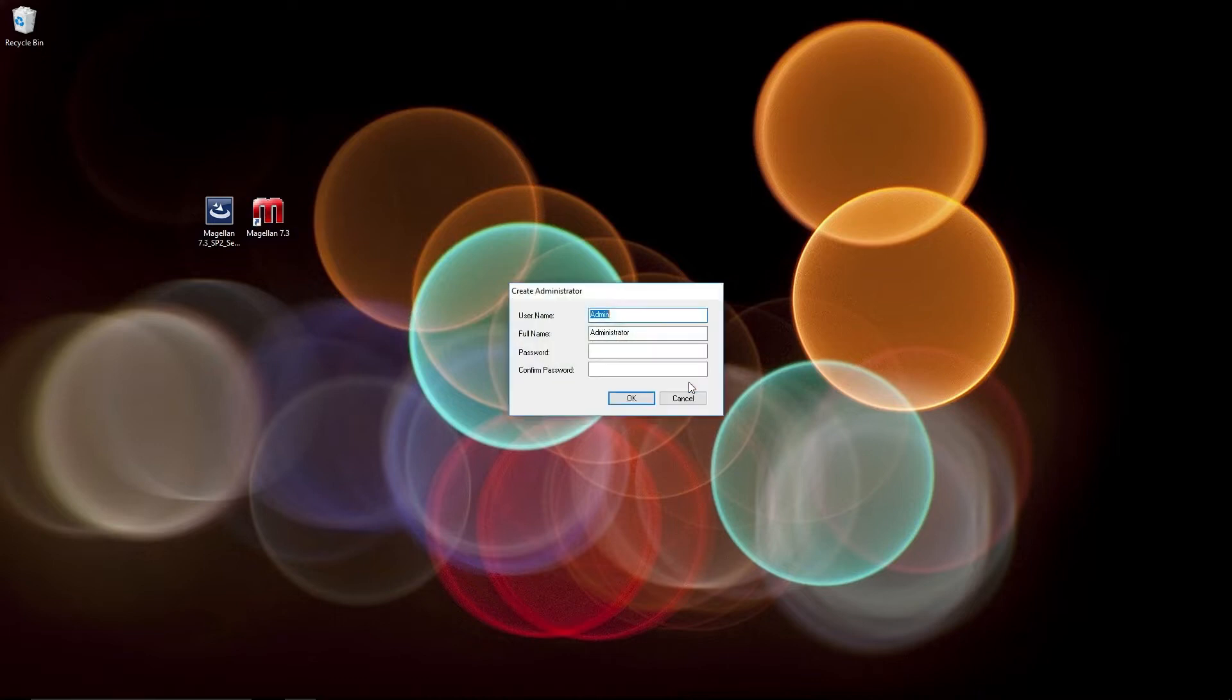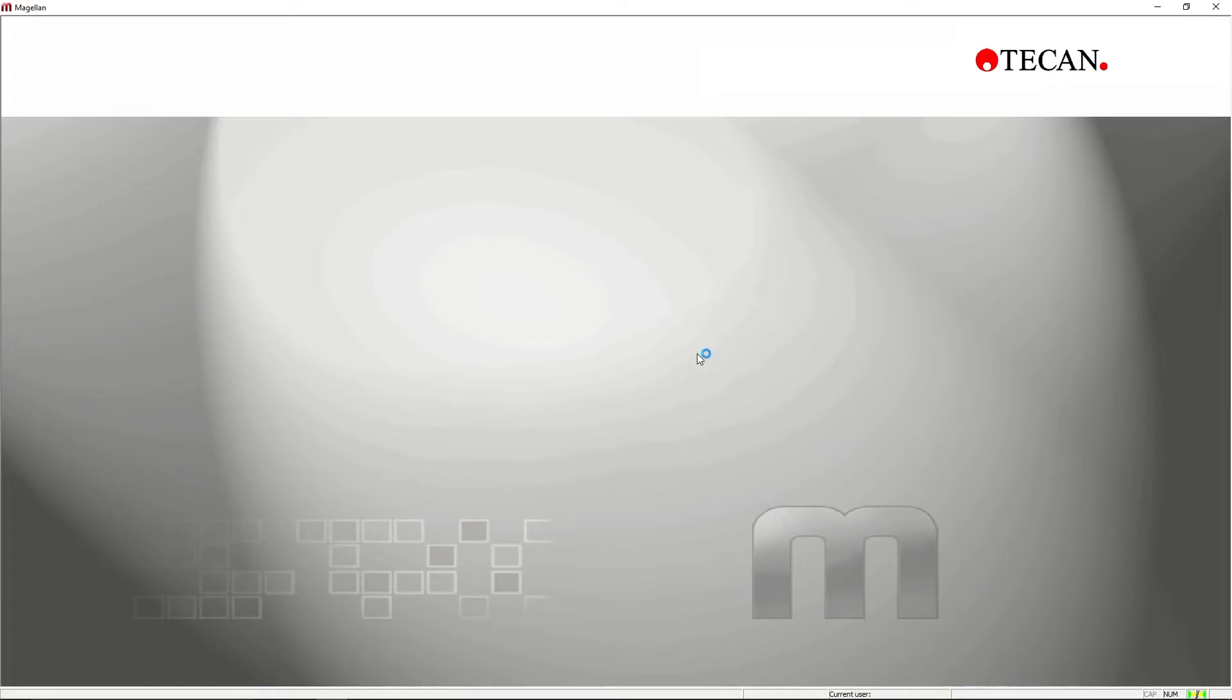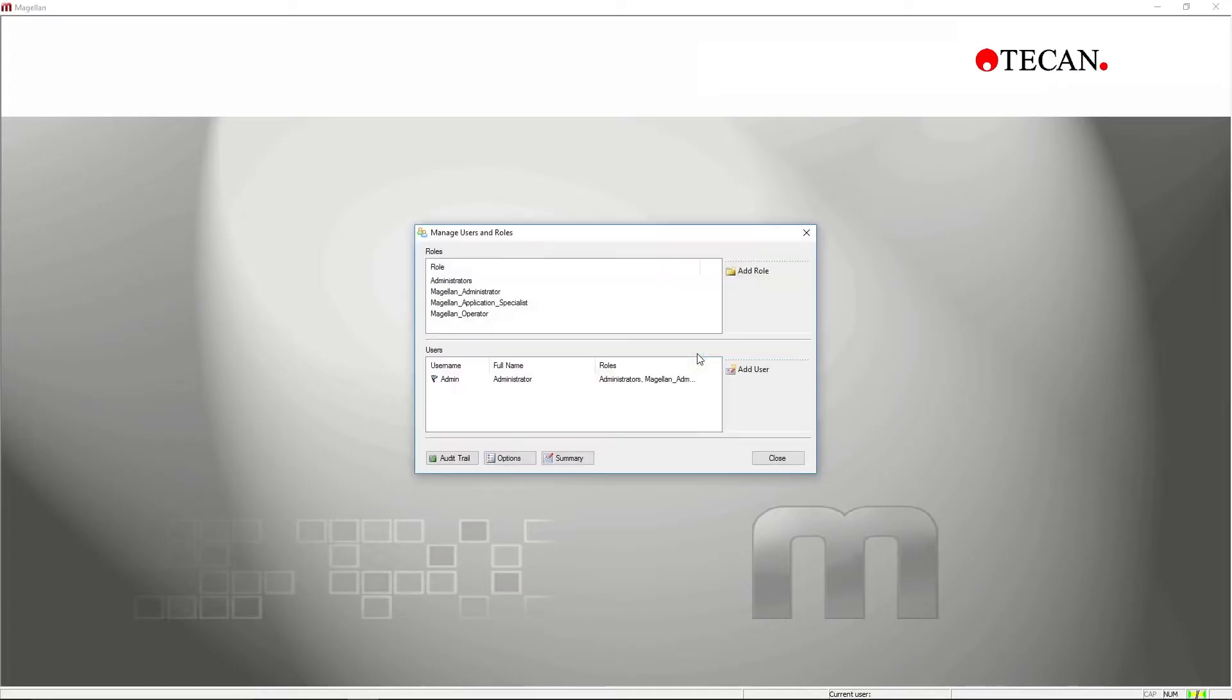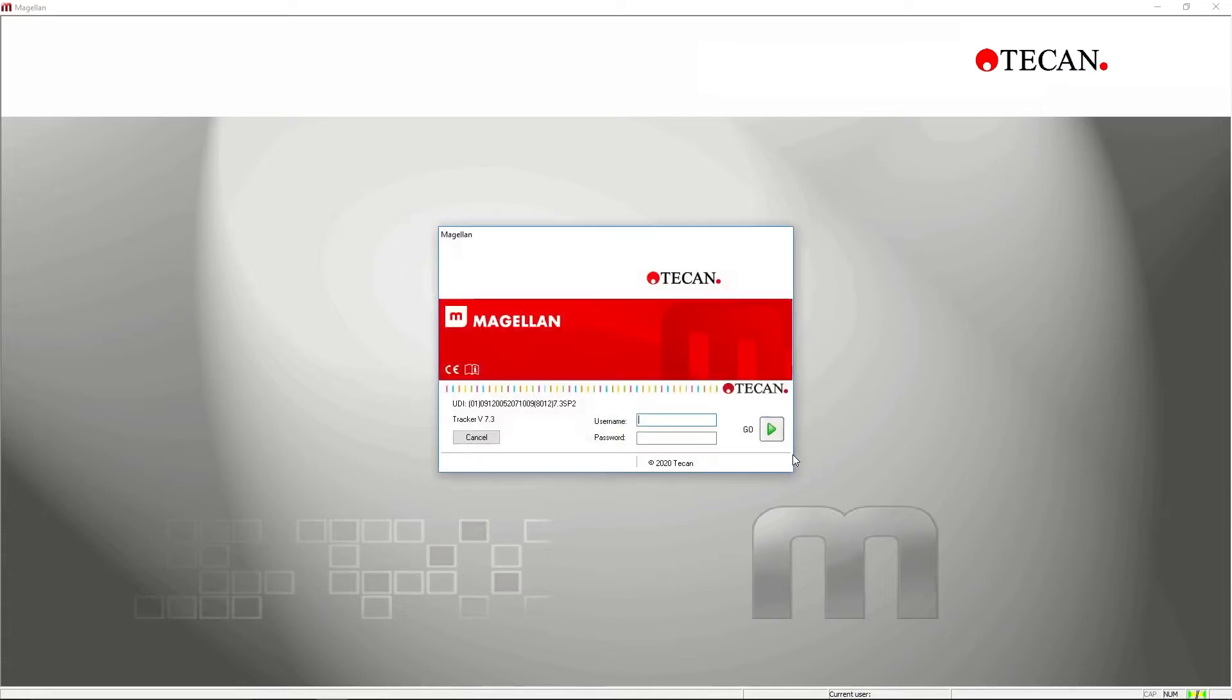This step is only necessary for Magellan Tracker. Later, you can create and administrate users in the user administration. Note that Magellan Standard does not require a user administration. Make sure to remember your username and password.